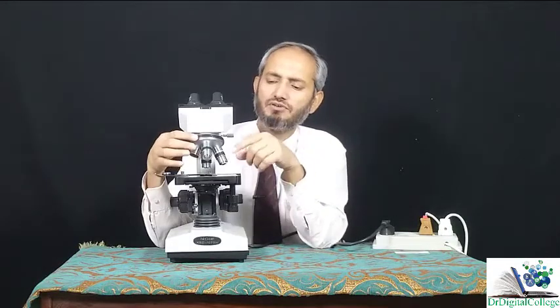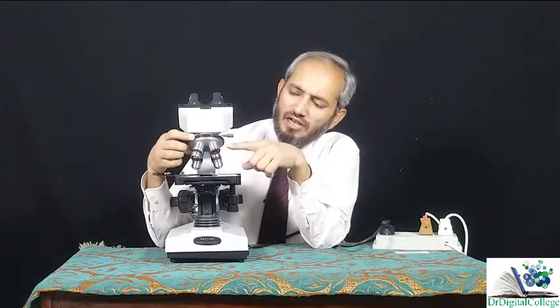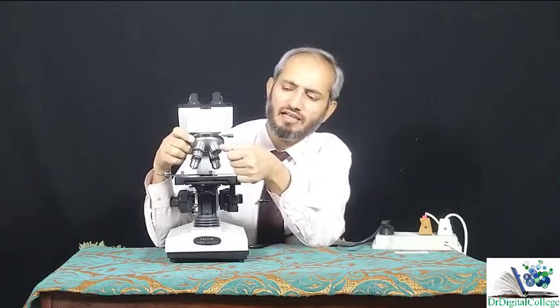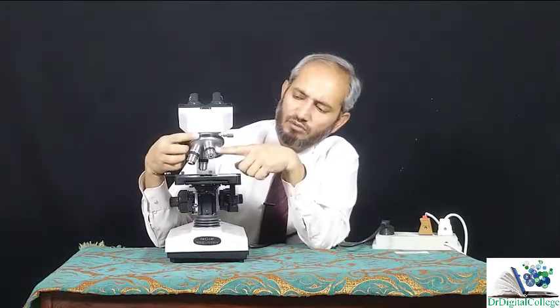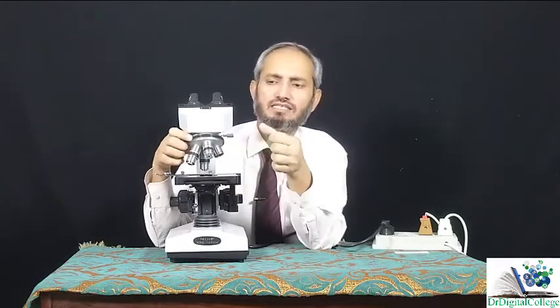I will tell you about the magnification later on, but first of all let me tell you what these parts are. The red, it is of lowest magnification. This is the red line over here. This is yellow. This is of higher magnification. This length is more and its magnification is 10x.